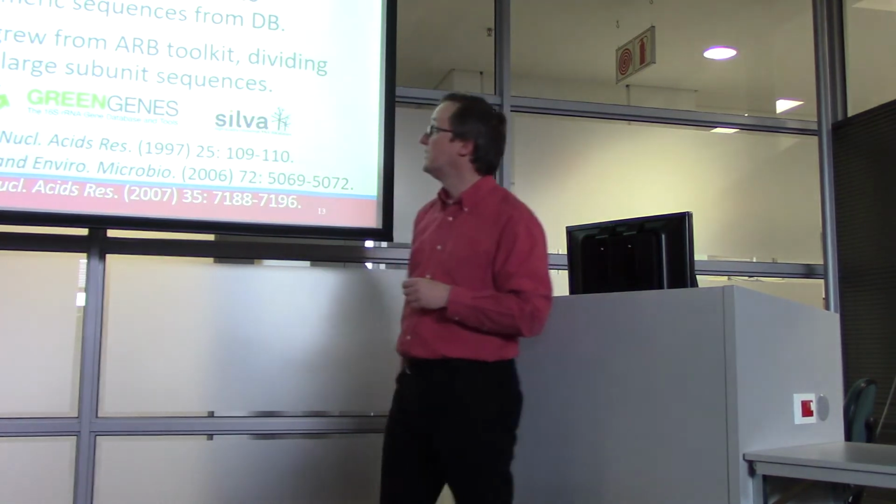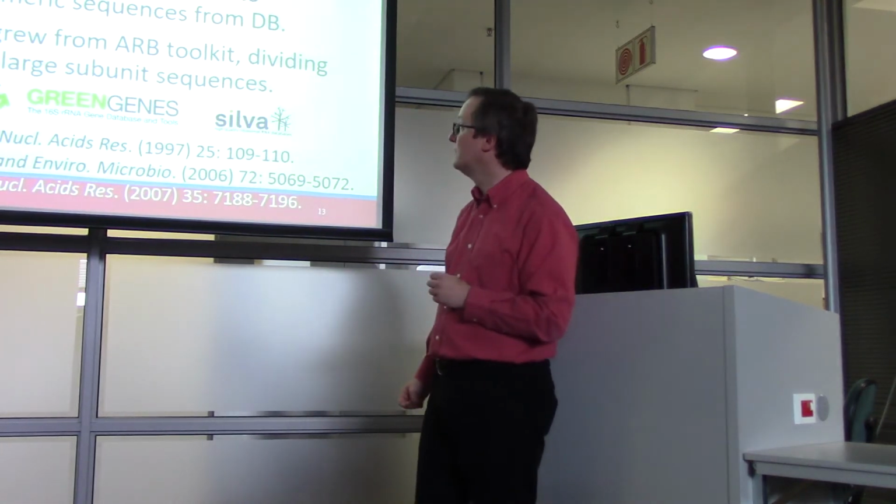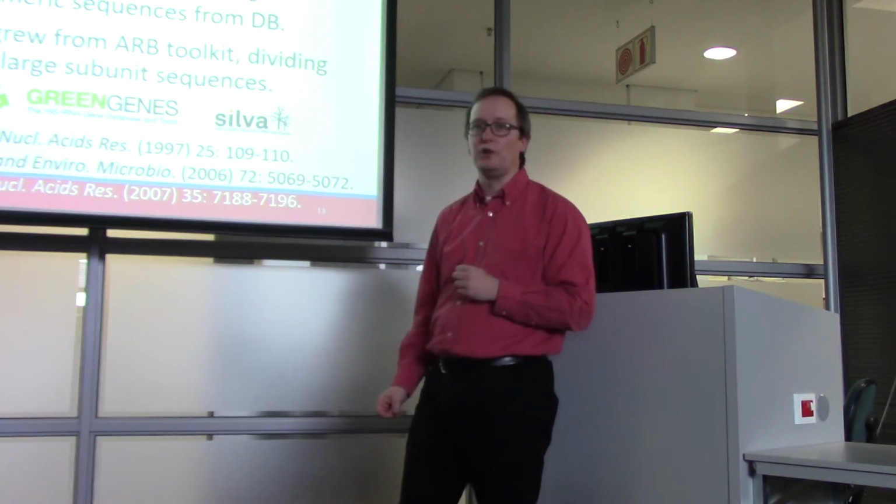Okay, and Silva is also very popular, 2007. It grew from a toolkit called ARB.